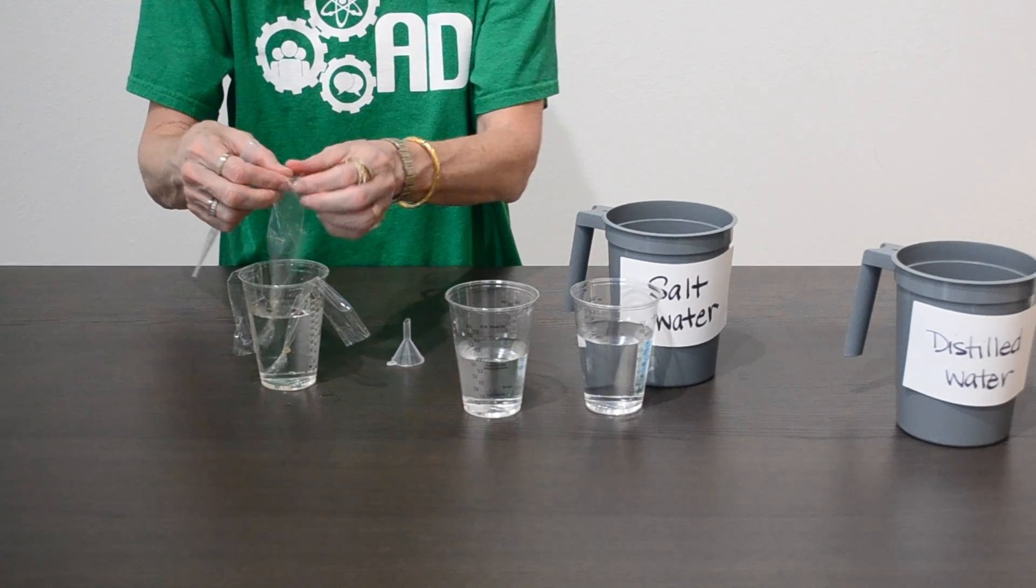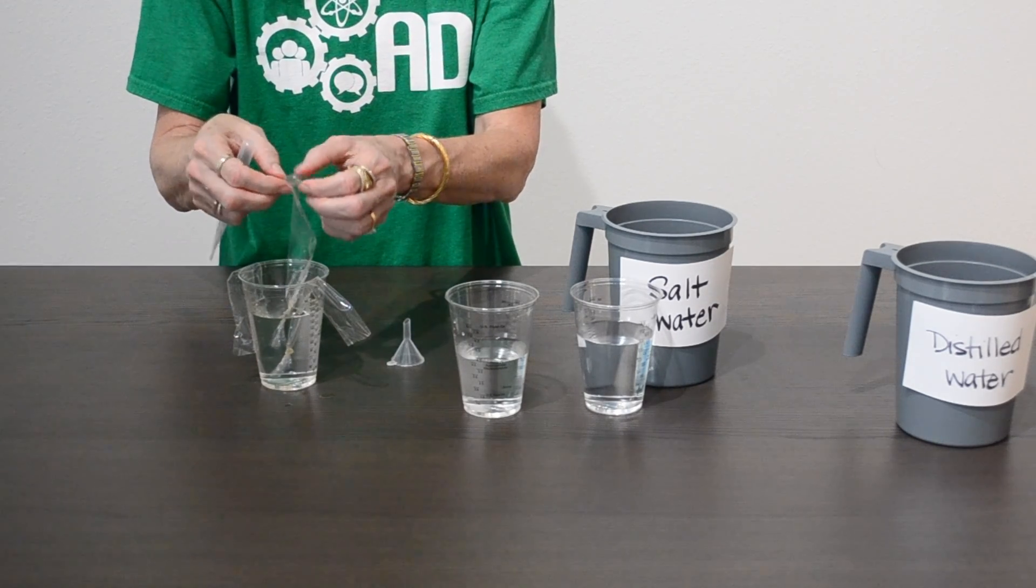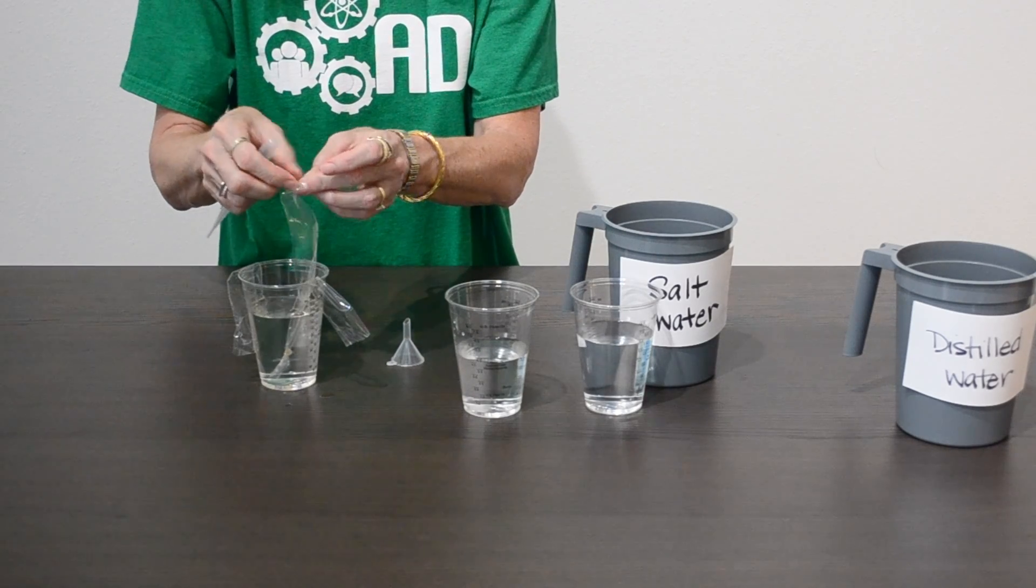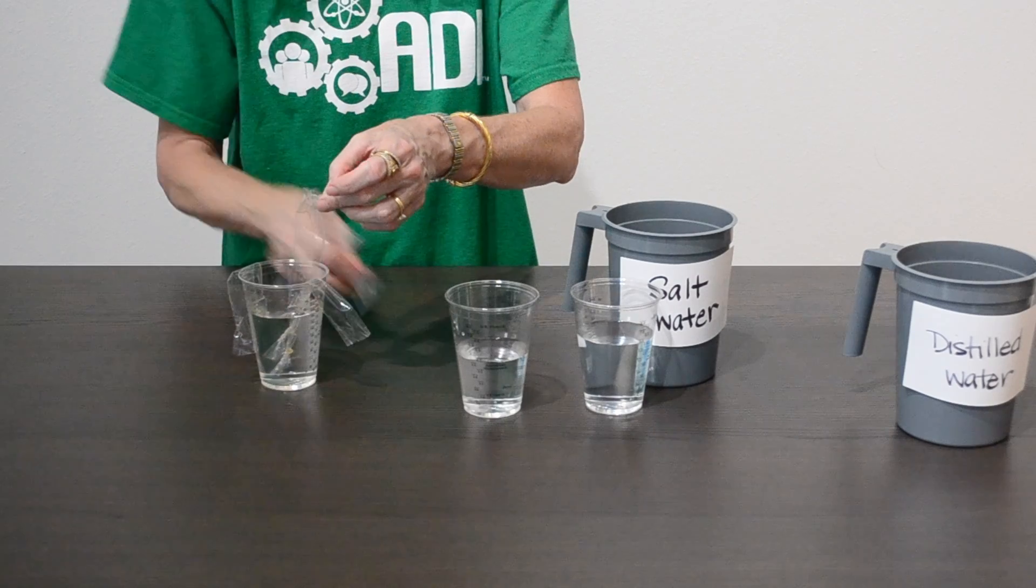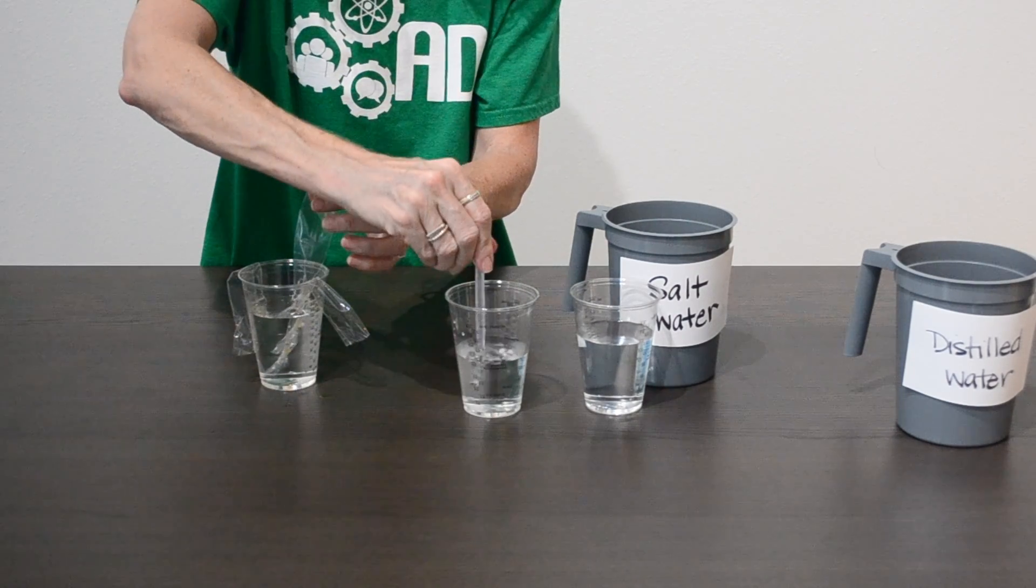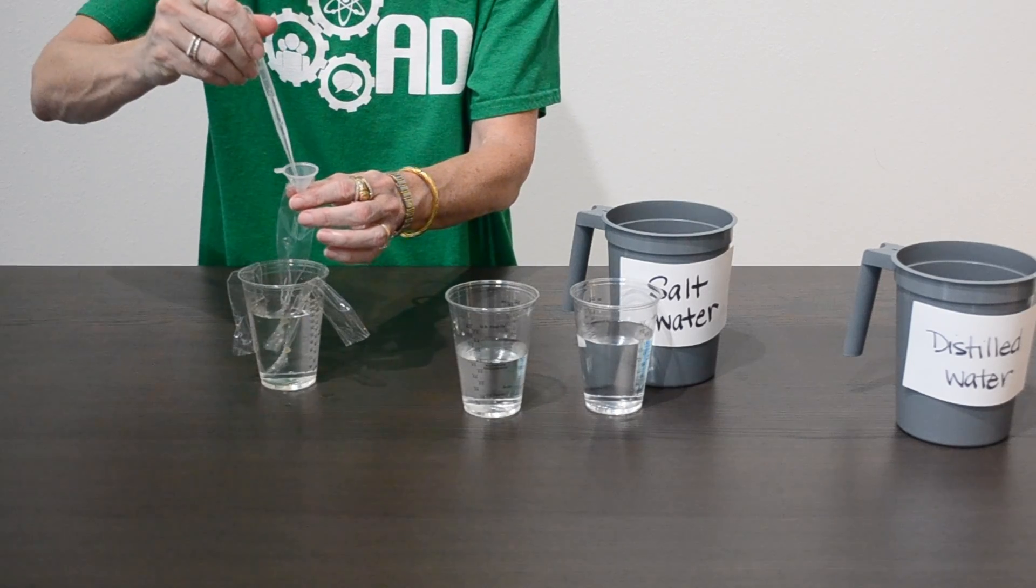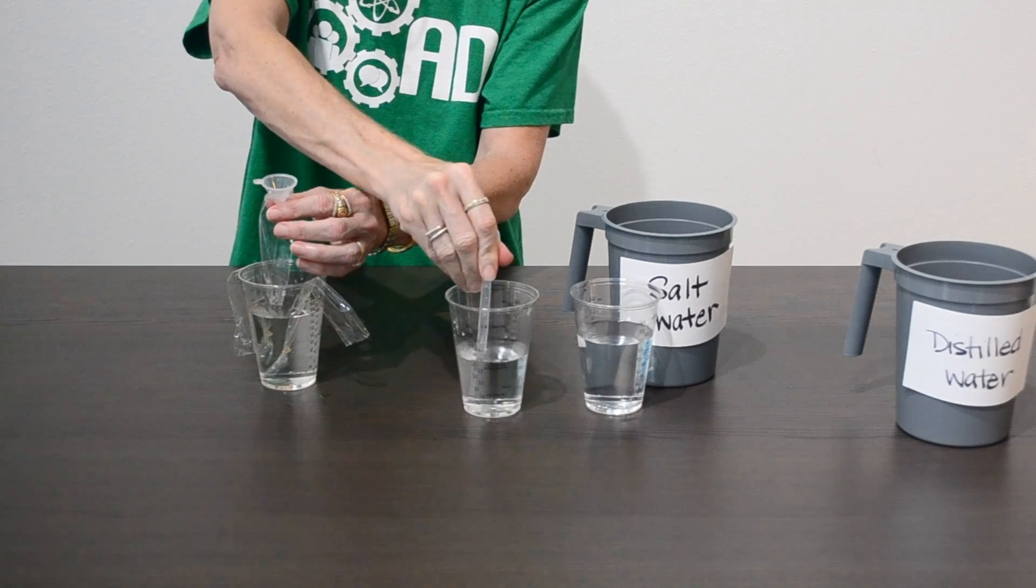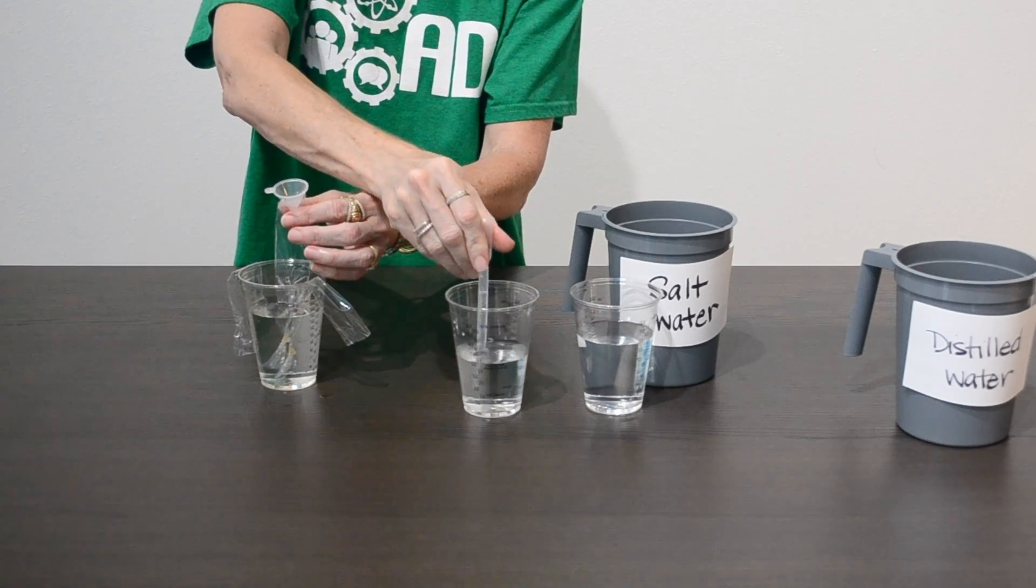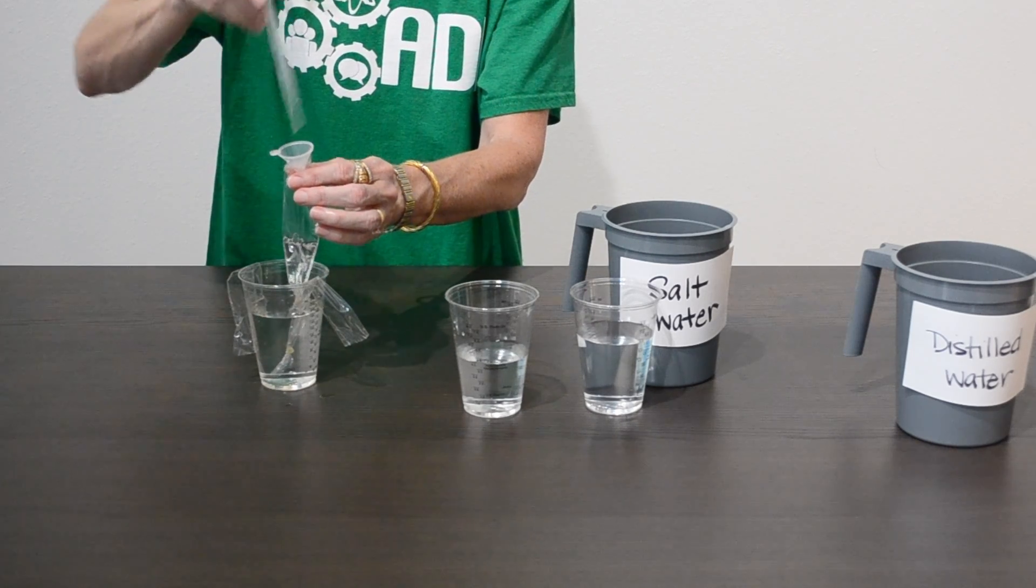Take one of the pieces of dialysis tubing and go ahead and work that end back open. It is a little sticky sometimes. Some people find it useful to use a small funnel to help hold that open. You're just going to put in enough distilled water to create a nice cell, keeping in mind that you will need quite a bit of an end to tie that second knot.